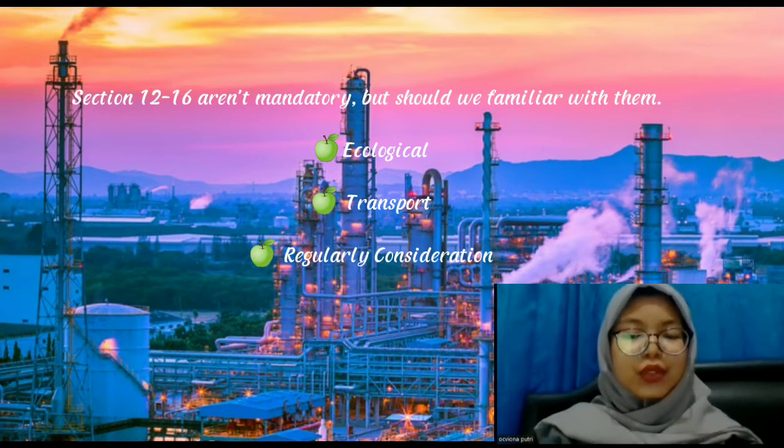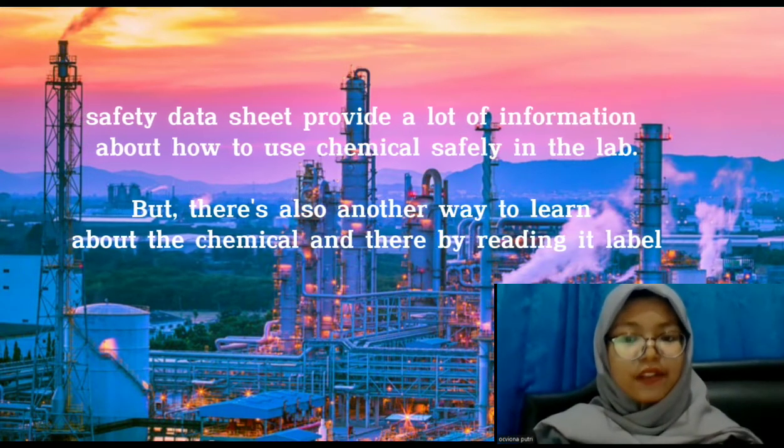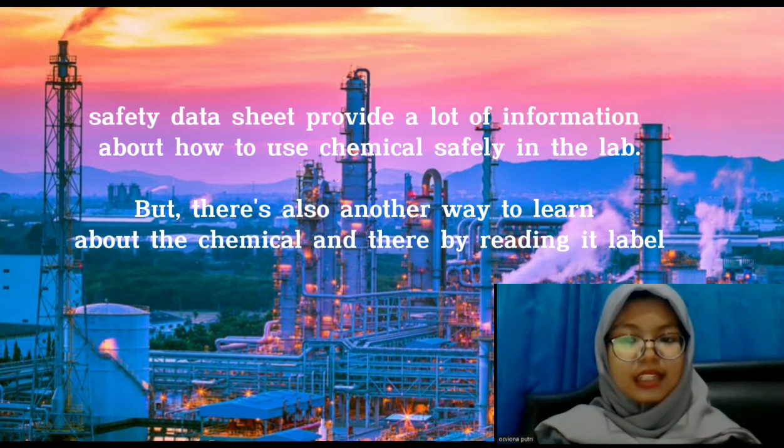Sections 12 to 16 are not mandatory, but you should at least be familiar with them. Ecological, disposal, transport, and regulatory considerations. Section 16 is for any other pertinent information. This is where you'll find the date the SDS was prepared along with the last known revisions. Safety data sheets provide a lot of information about how to use chemicals safely in the lab. But there's also another way to learn about a chemical, and that is by reading its label.